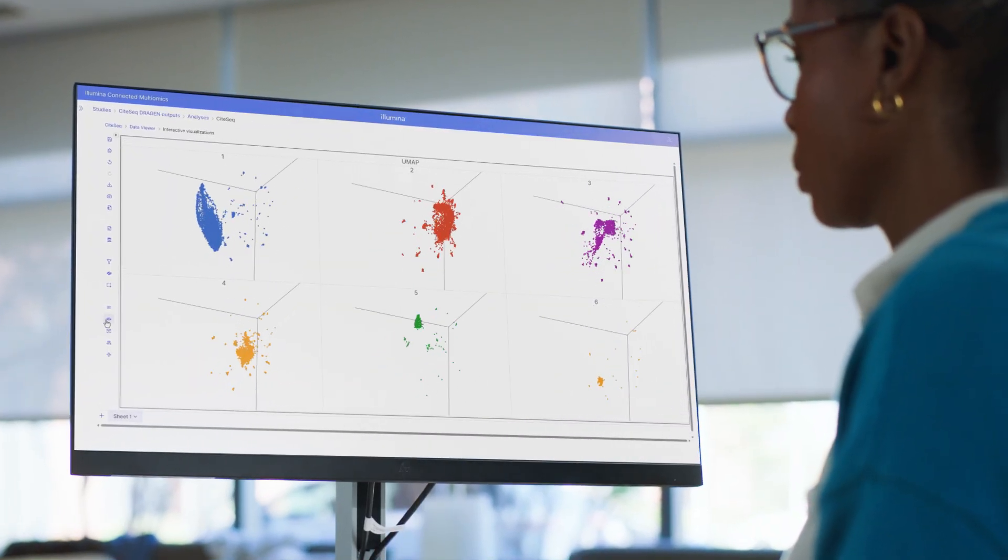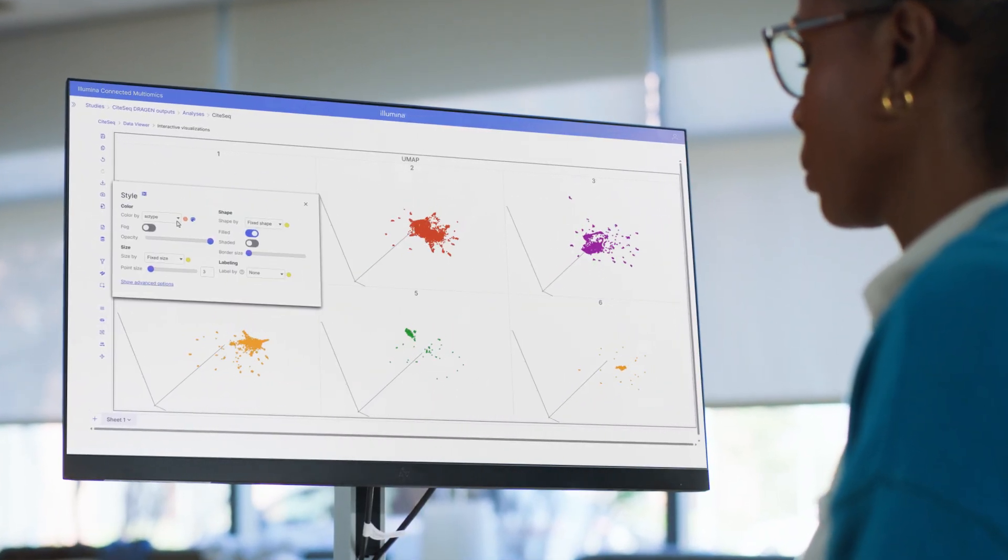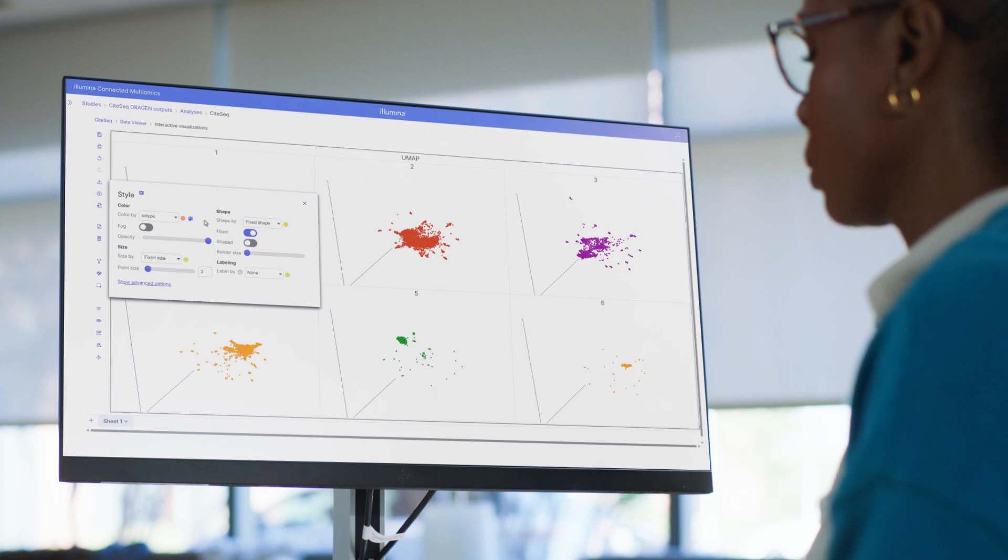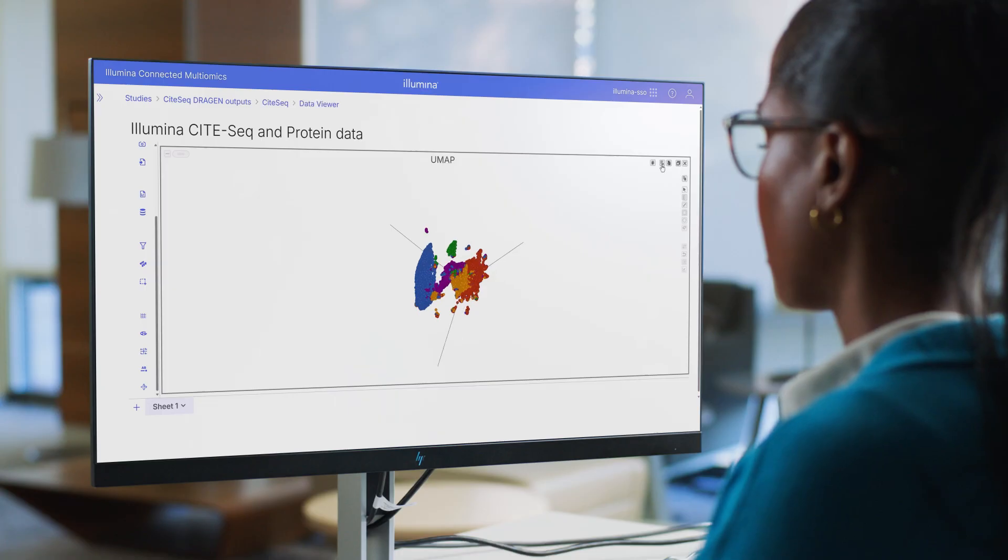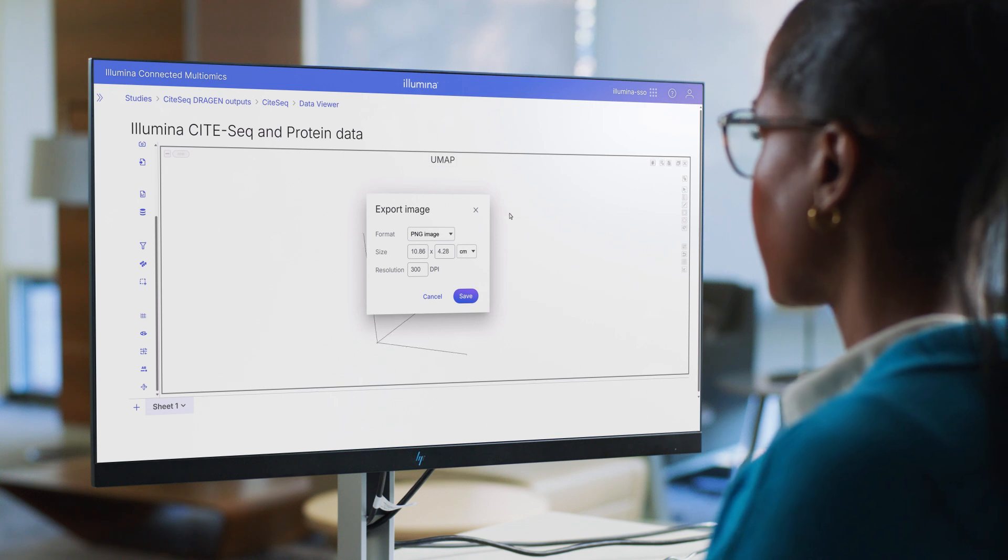I can keep refining the settings on my visualizations in real time until I achieve that aha moment, then save and easily export them in publication-ready formats to share in scientific literature.